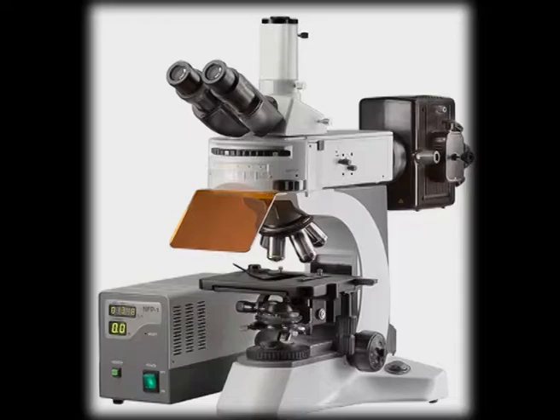Another phenomenon which happens after absorption is fluorescence. Now, fluorescence is not present in all molecules. There are criteria for a molecule to have fluorescence. First, it should absorb light.